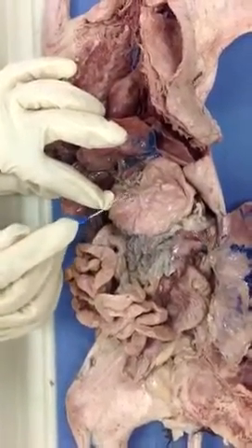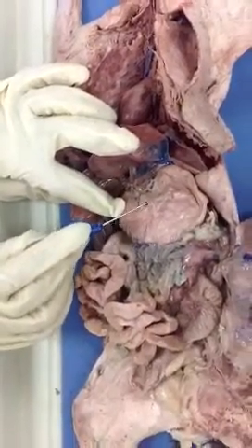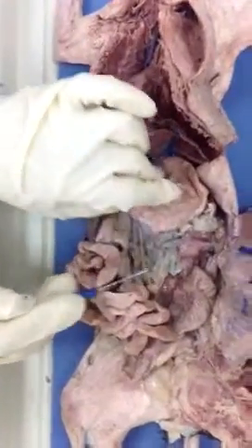Here I encounter another structure. What is this here? Lesser omentum. Very good. And it goes from the lesser curvature of the stomach to the liver, and it covers the caudate. There you go. Very good.